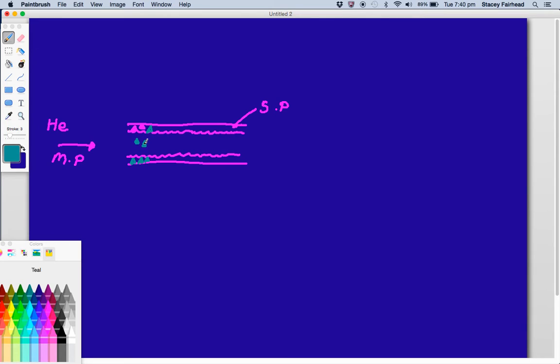Some gases or some liquids that get injected that you're analysing will have a tendency to remain more in the stationary phase than they do in the mobile phase. And some of them will go ahead and enter into the gaseous phase very easily. And so that would be these ones here. Okay, there's more of them in the mobile phase and less of them here in the liquid stationary phase.